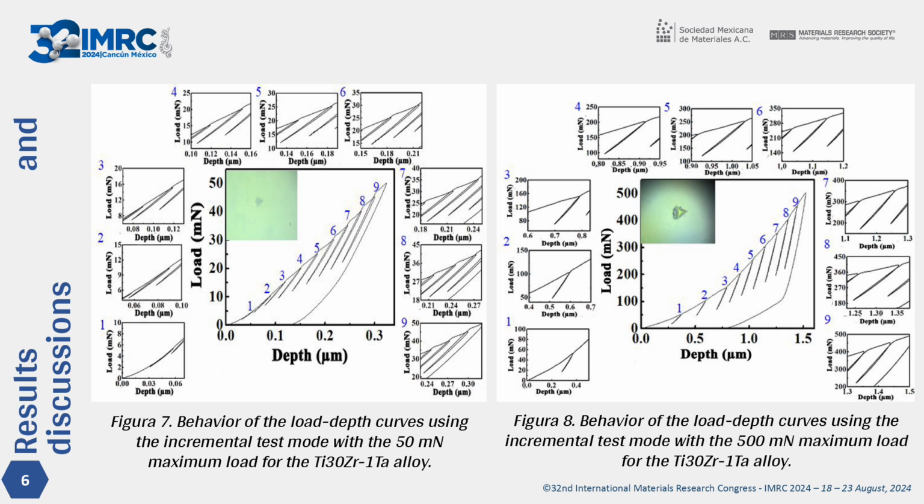2 to 9, which in thin films are attributed to viscoelastic bouncing, reflecting a fatigue effect. In the case of metallic materials, the determination of slow creep or plastic behavior is related to the ability of continuous deformation under constant load and moderate temperatures. While materials exhibiting plastic deformation rarely demonstrate shape memory.